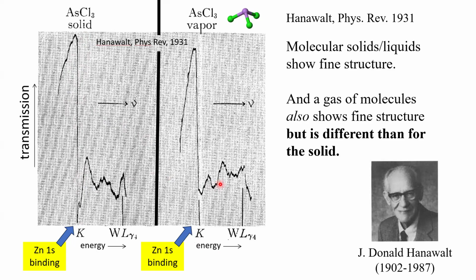And so that means, right, this is a molecular solid, and so the XAFS is not just sensitive to immediate chemical bonds. It has to be sensitive to something in the first shell and beyond the first shell. This is wonderful qualitative work.